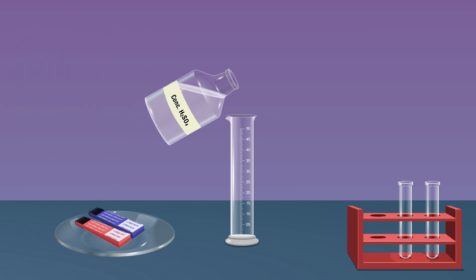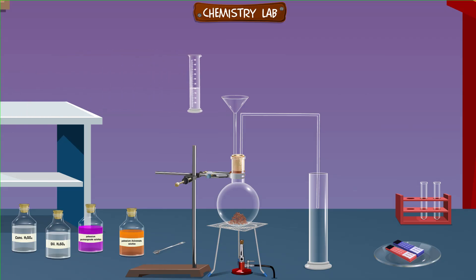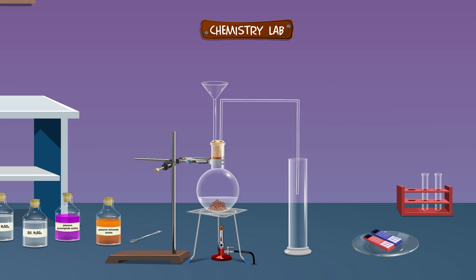Take 20 ml of sulfuric acid in a measuring cylinder. Then gently add 20 ml of concentrated sulfuric acid to the round bottom flask using the thistle funnel. Ignite the burner and heat the contents gently as gas formation starts. As the gas jar gets filled with sulfur dioxide gas, close the mouth of the gas jar using the cardboard.